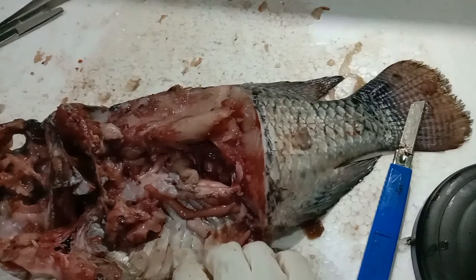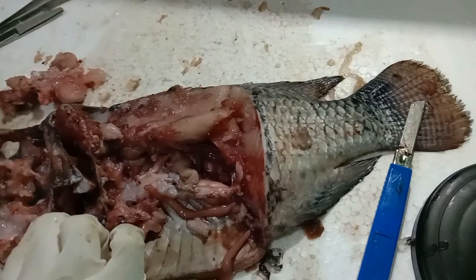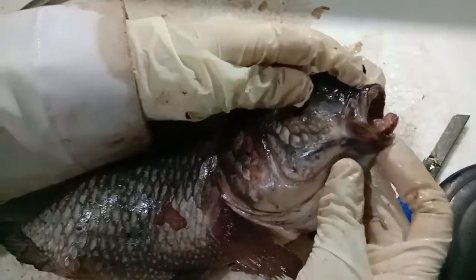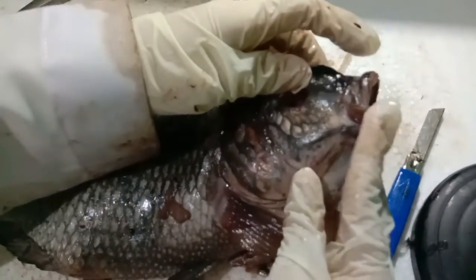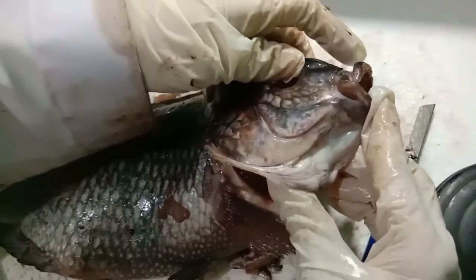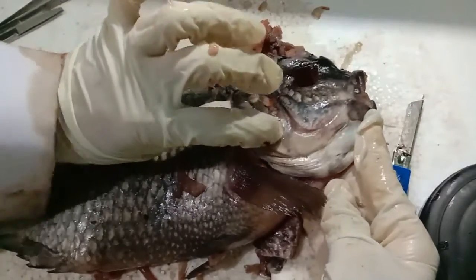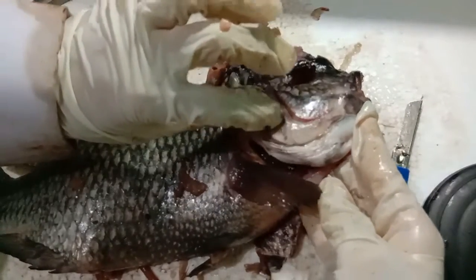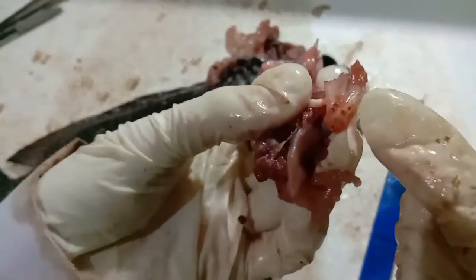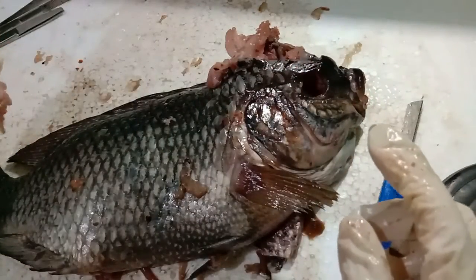The last discussion is about the skeletal system. Starting from the head, there is an upper jaw and a lower jaw. Here, this is the upper jaw and the lower jaw. At the mouth of the fish, there is an operculum here that covers the gill, and there is this skull here as the bony case of the brain of a fish.